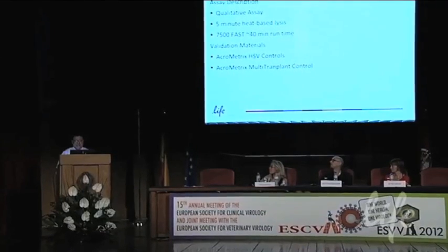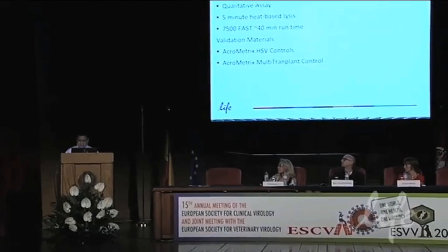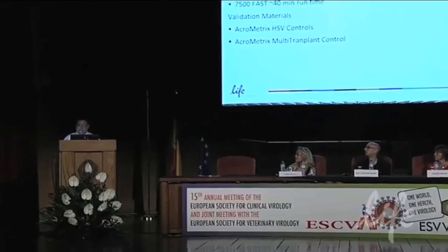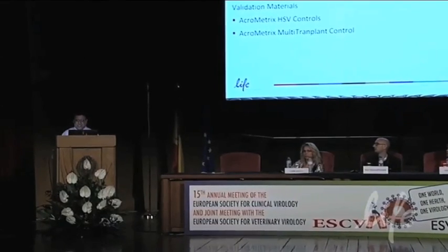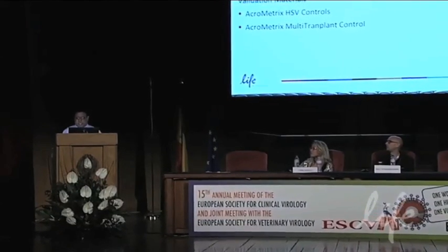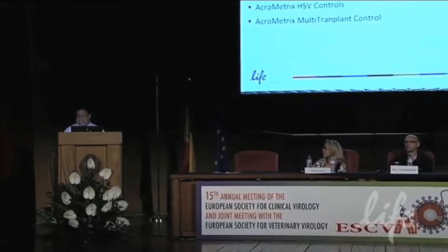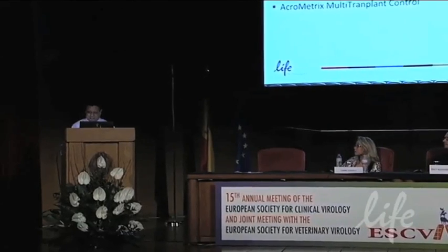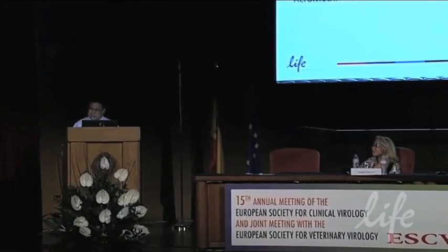But we're going to use the Quidel HSV 1 and 2 EZQC assay as an example. The reason we use this assay as an example is because we currently have an in-house HSV assay that we use for research and development, for release testing, for stability testing. It has an extremely terrible limit of detection, and so we were looking for alternative assays.